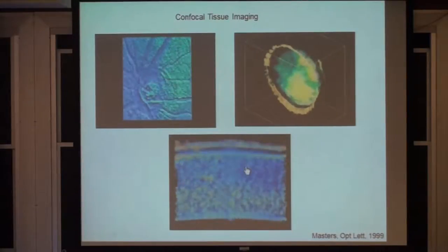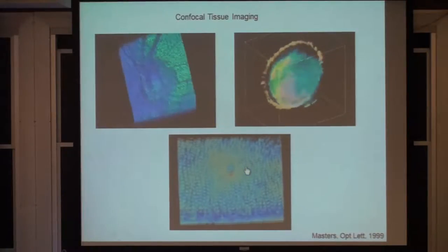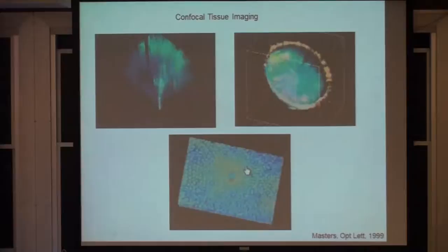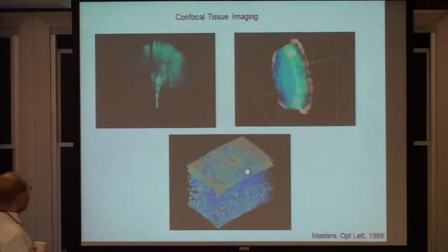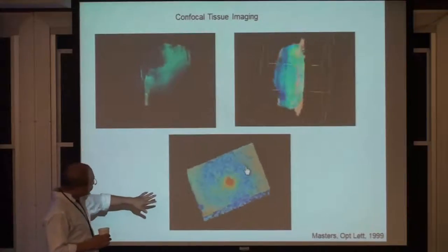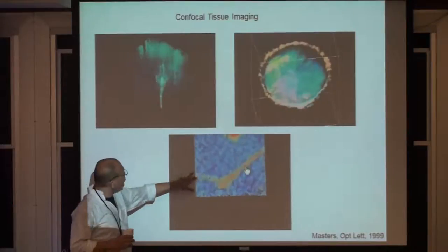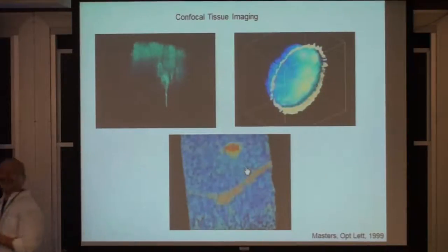as the image passes through, you can see the individual nuclei there. This is the so-called Bowman membrane, which is the germinative layer on the cornea of the eye. And as you go through, you can see that as well. If we go through, we can't, I think I made the movie too long. So here's the optical nerve.